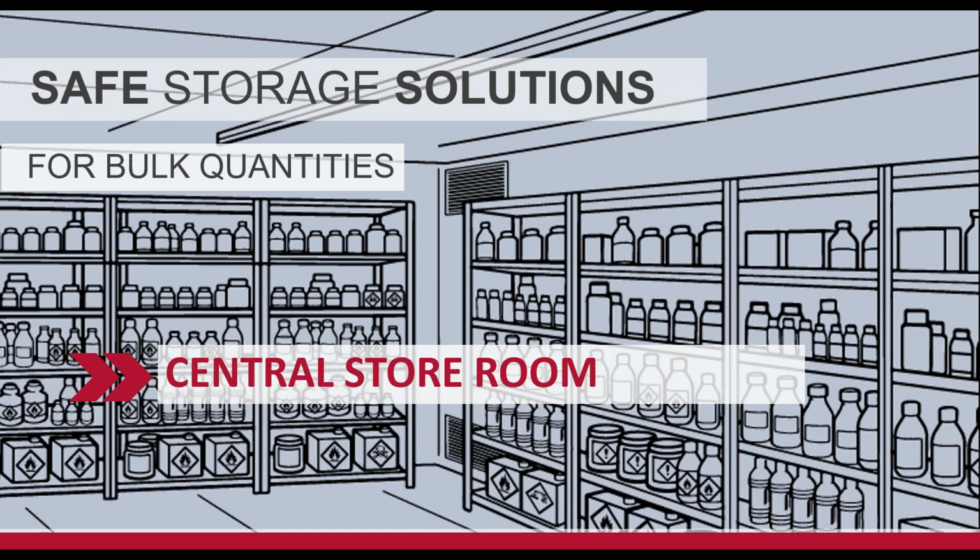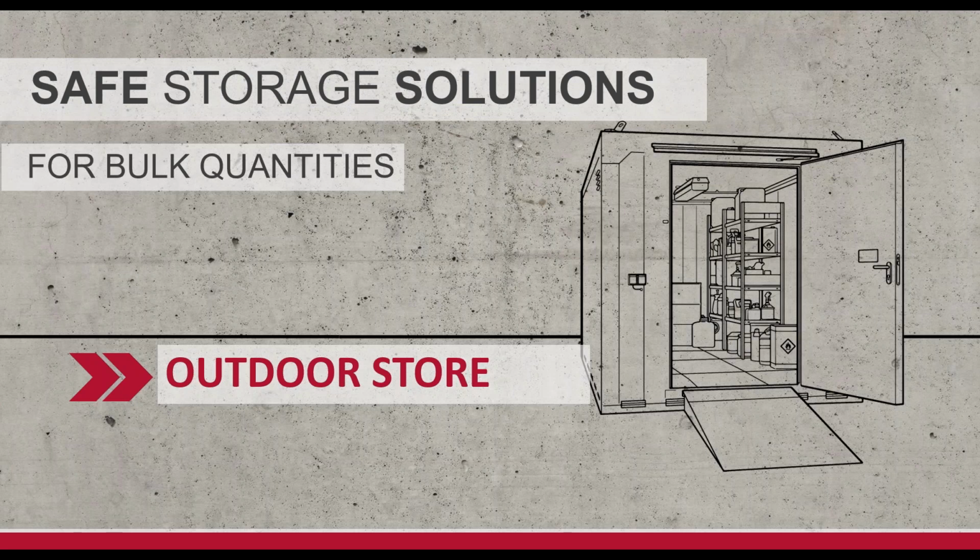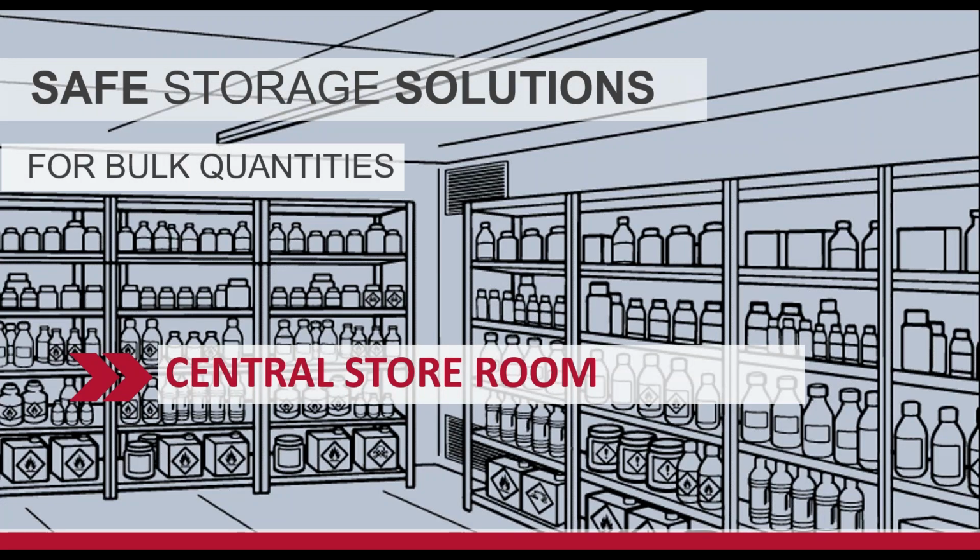But if I look at that from the safety and the design side, in either one of these scenarios, whether it's the outdoor storage or the indoor storage, ventilation's done right, right? You're going to achieve your air changes. We've created class 1 or div 1 or explosion proof type environments. So if there is something that happens in that space, it's created safe. Now, what is not safe and designed for chemical use is the trip between A and B. The trip from one of these to the laboratory where they're going to do that.